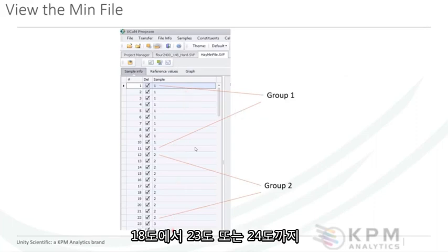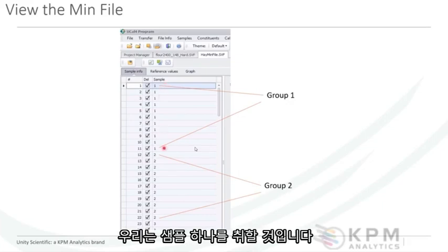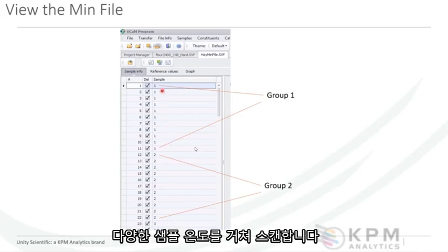So I'm going to be using temperature in this discussion. Let's say we wanted to compensate for, in our laboratory, from 18 to 23 or 24 degrees C. We would take one sample in one sample cup, hopefully no repacks, no anything, the exact same sample in one sample cup on an instrument, and we would scan it at the various sample temperatures.